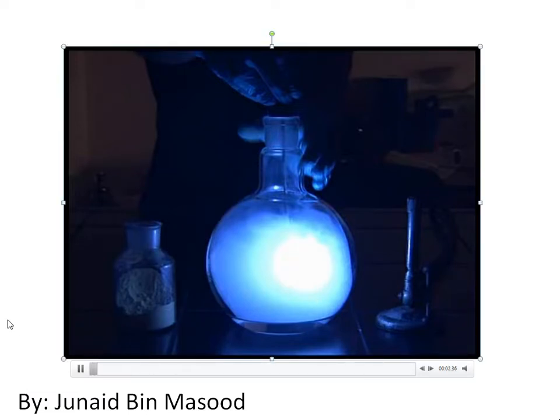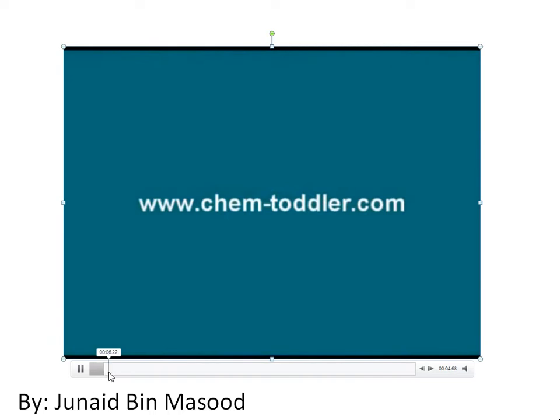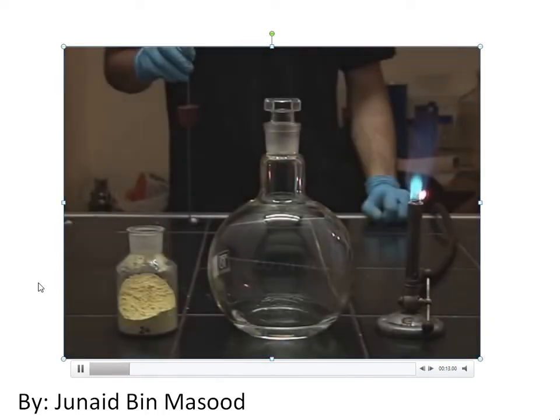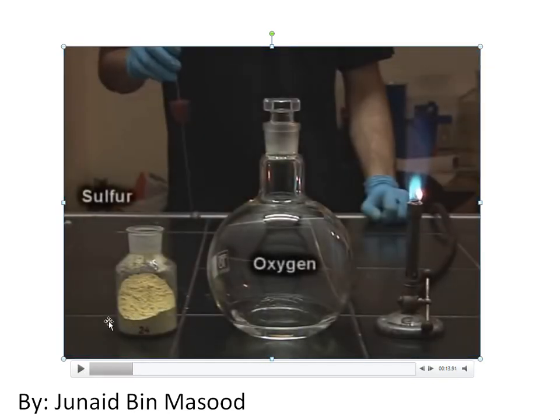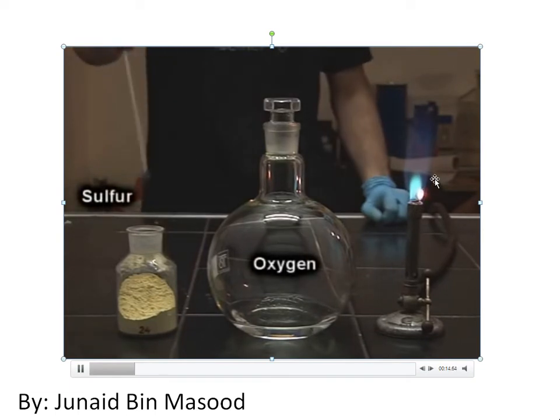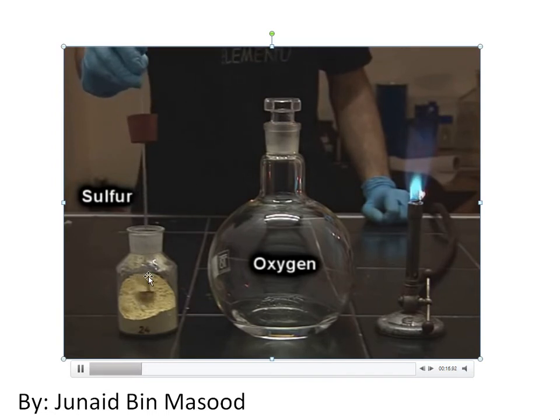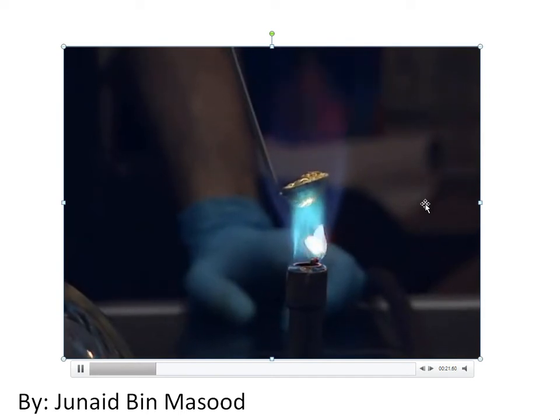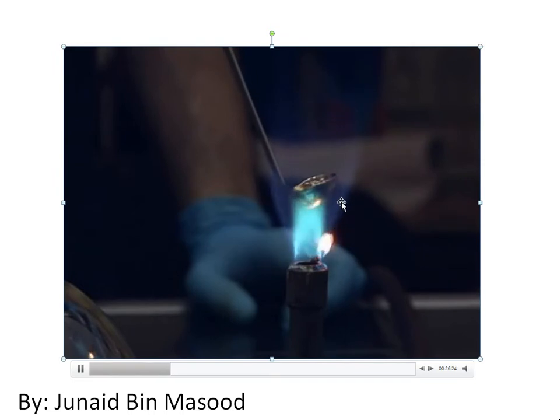oxygen burning, okay? Burning of sulfur with oxygen. So sulfur basically burns in pure oxygen with a brilliant blue flame, and it produces what? It produces sulfur oxide, okay? So this is sulfur, the yellow compound. This is oxygen enclosed in this flask, and this is heat. So we take the sulfur and we start heating sulfur, and basically sulfur burns with a blue flame, okay?